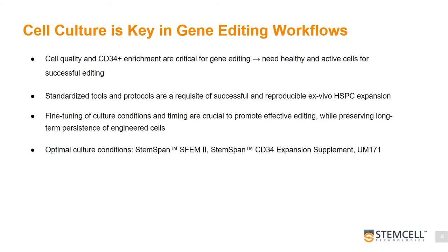To briefly summarize this part of the webinar, we discussed and showed that cells itself and cell culture are key in gene editing workflows, where healthy and active cells are required for editing, where a requisite of successful and reproducible cell culture are standardized tools and optimized protocols, and that fine-tuning of culture conditions and timing are crucial to promote effective editing while preserving long-term persistence of engineered cells.